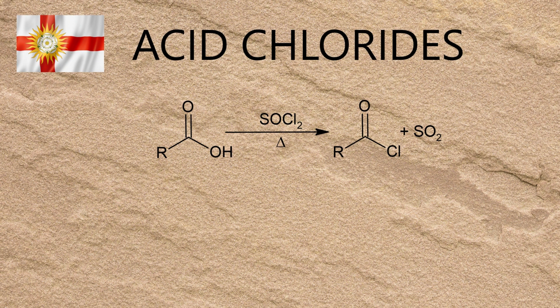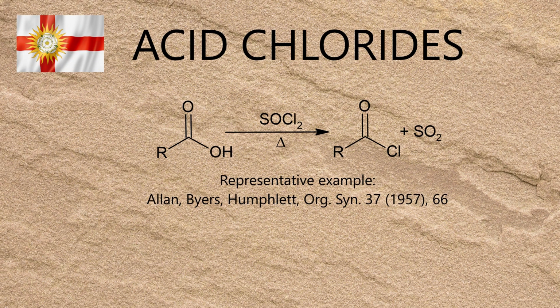However, thionyl chloride is a fuming toxic liquid about as hazardous as bromine that's hard to come by for amateurs and even harder to homebrew. Preparing it involves reacting sulfur chlorides, which allegedly smell like death, with sulfur trioxide, which is basically concentrated sulfuric acid's bad uncle on steroids. Neither of these are materials I ever want to deal with if I can possibly avoid them.